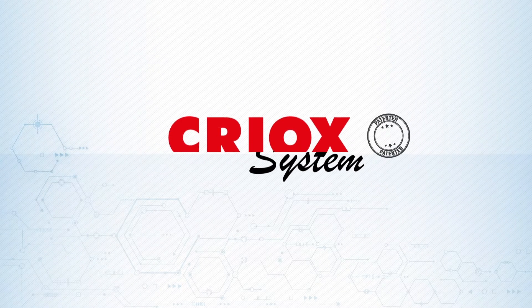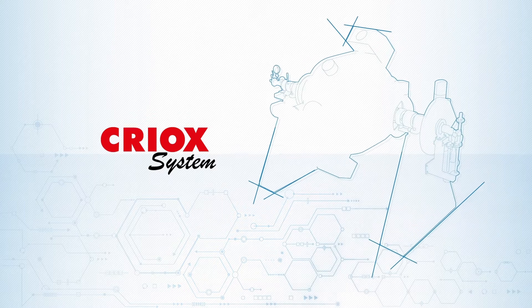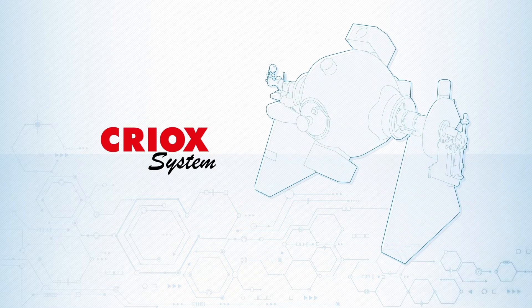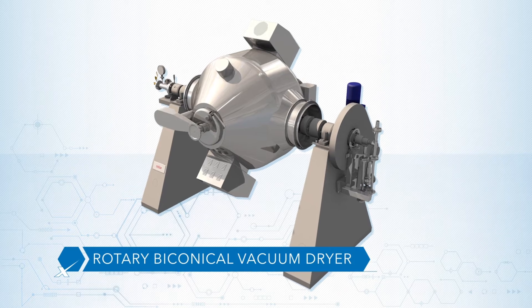Ital Vacuum patented the CREOX system, a rotary biconical vacuum dryer able to completely remove all types of solvents and water from humid masses after centrifugation and filtration steps.